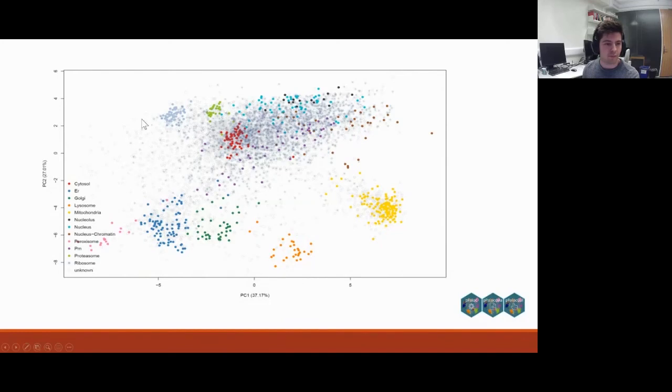So what do our data look like? So all the circles, as before, are our proteins. Again, some of them are colored. These are proteins with known localizations. And I've drawn little snowflakes, and these are our phosphoproteins that we measured. As you can probably see, there seems to be an enrichment in the top right-hand corner of the plot, which is not unsurprising. These are the nuclear and cytosolic regions where we expect phosphorylation to be quite high. And we see only a few points in this mitochondrial region where succinylation is a much more important post-translational modification, and phosphorylation is rarely seen.